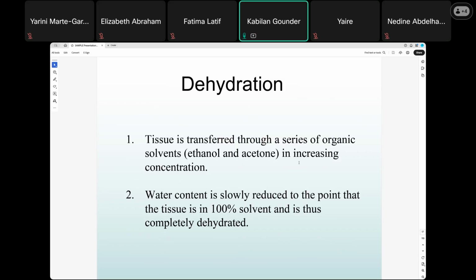So once you fix your sample, the next step is dehydration. Dehydration is very, very important and serious. Every time we go to a primary care physician or to emergency, they immediately check our lips and eyeball movement. Do you know why they do all this?